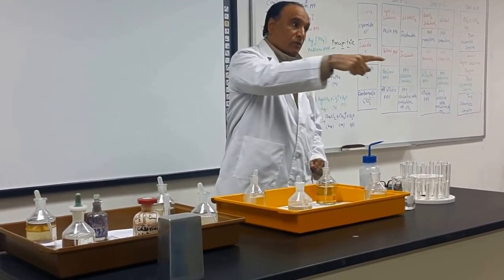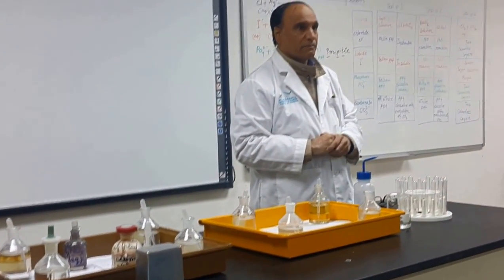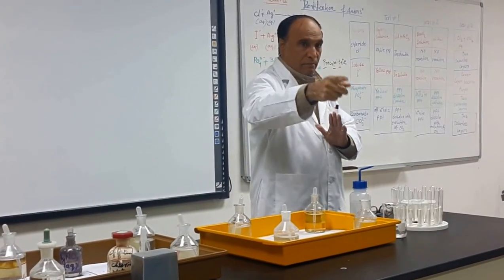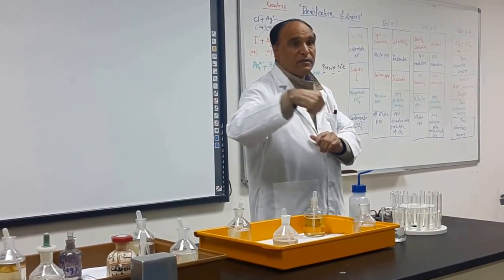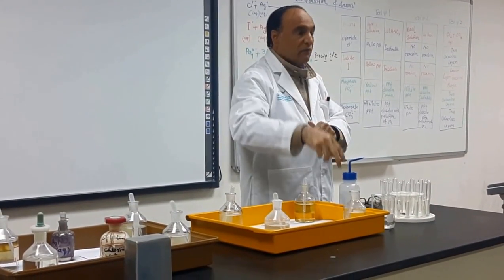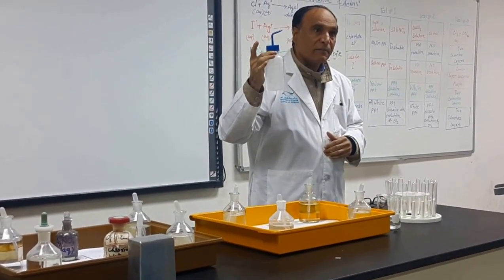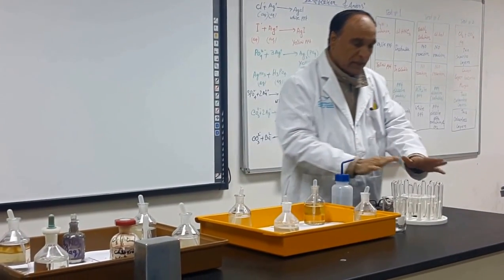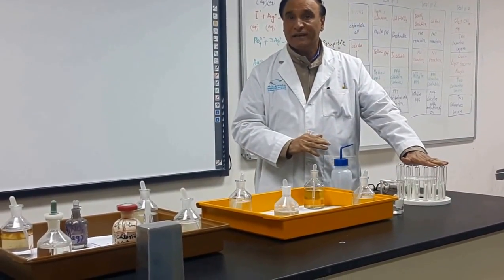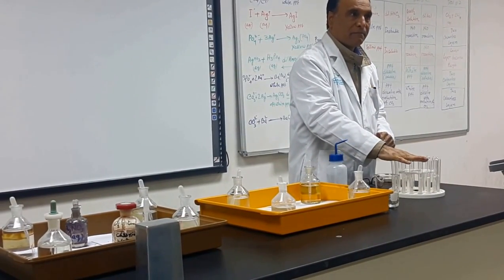You see, all the test tubes are neat and clean. Who made them neat and clean? Who washed them? The previous student. When you go, make them like that. Wash them with the brush and with the soap. And when you go, don't wash with the distilled water. Who will wash with the distilled water? For example, did you see these test tubes are clean? But they are not clean with the distilled water. I will start the experiment, I will make them clean.